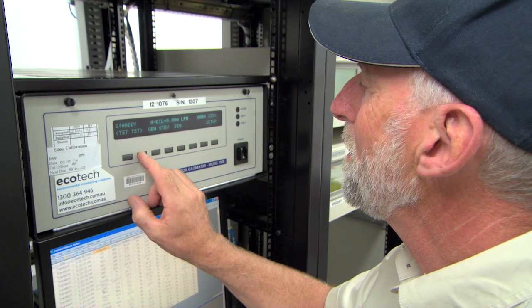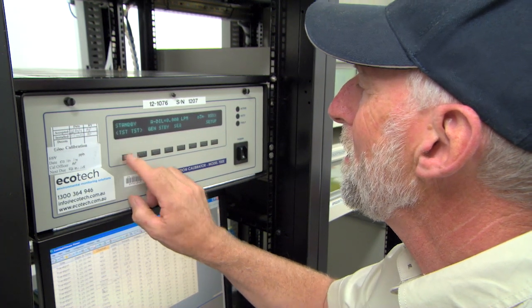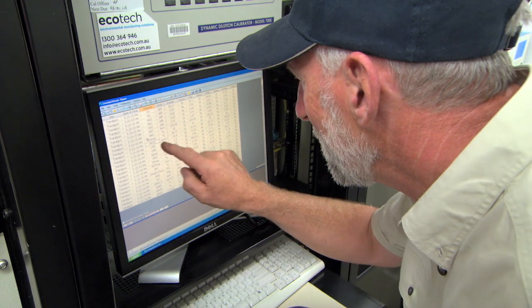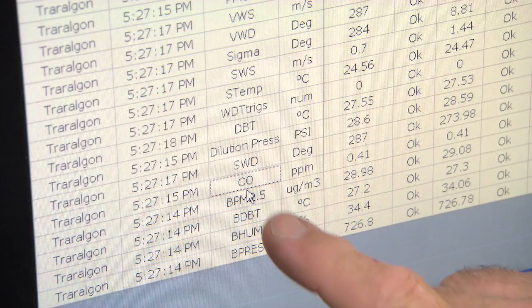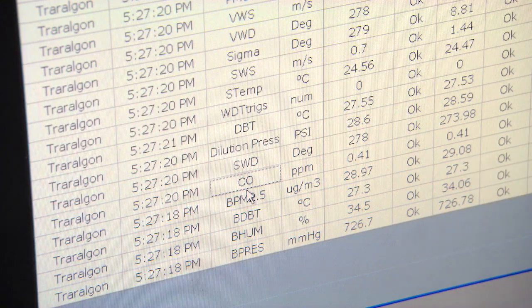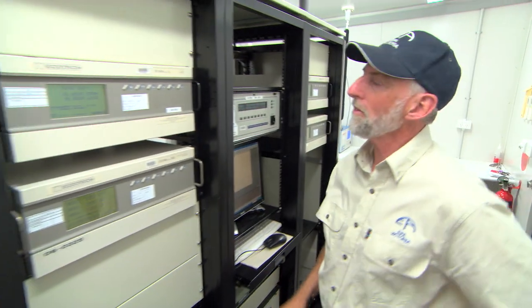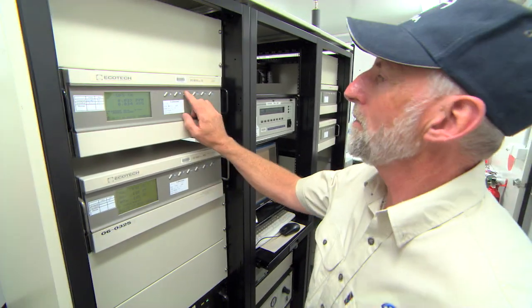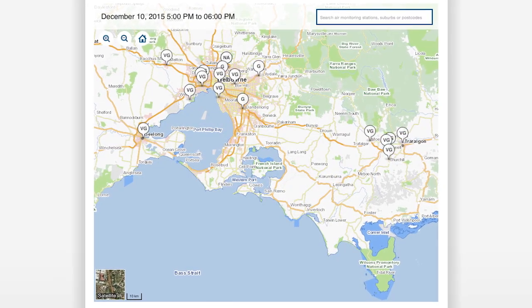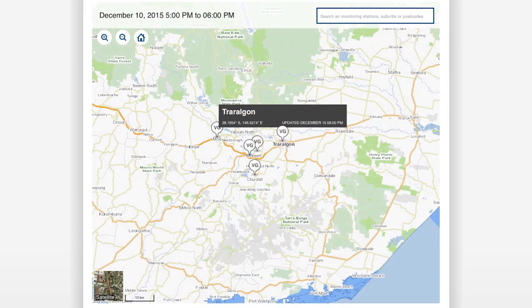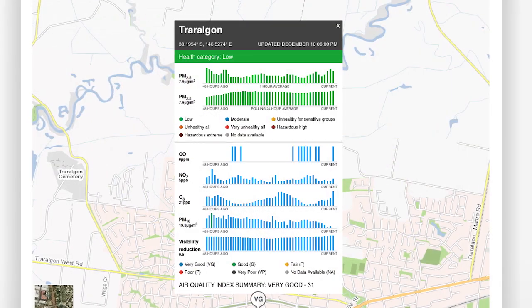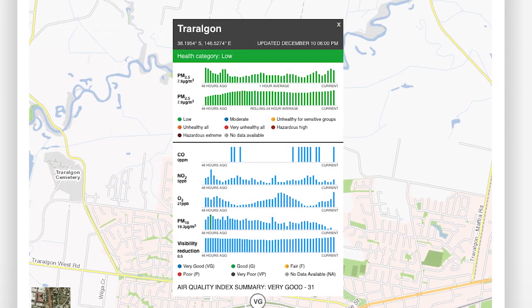All the air quality data collected by the different types of instruments inside the air monitoring station is sent to this computer, 24 hours a day, 365 days of the year. From here, the data is sent to our computer and then goes up on the EPA's website. EPA scientists also use this data to prepare daily air quality forecasts and summaries.